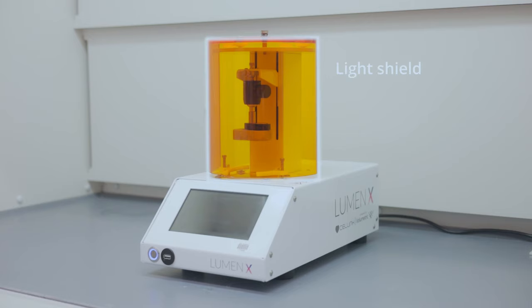This is the light shield. Please keep it closed while printing. This is the build platform. It measures 65 by 40 millimeters, and objects can be printed up to 50 millimeters tall.